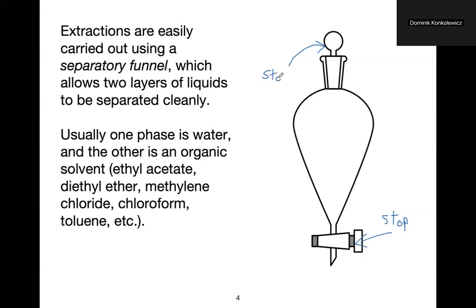So the stopper just is removed, okay? So we can simply remove this, add any solvents we like once it's removed, so we can just add solvents freely into here, okay? Keeping this at the bottom closed, okay?